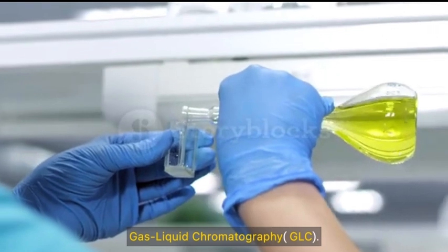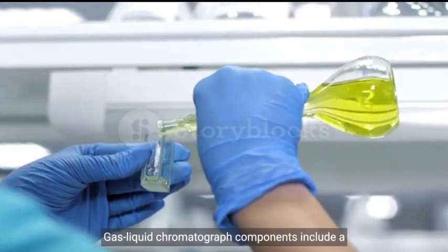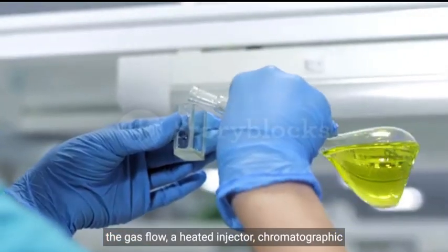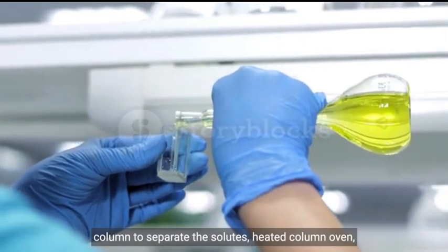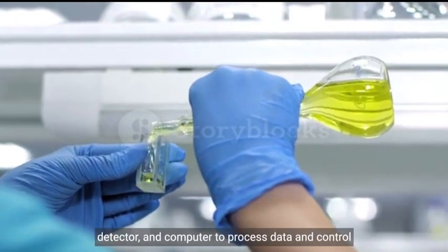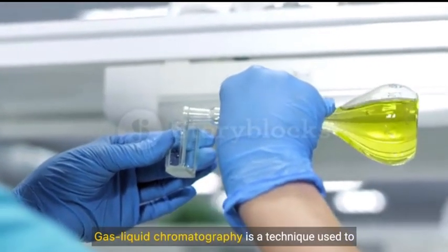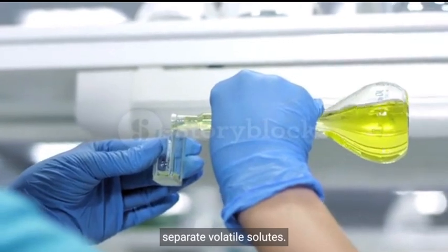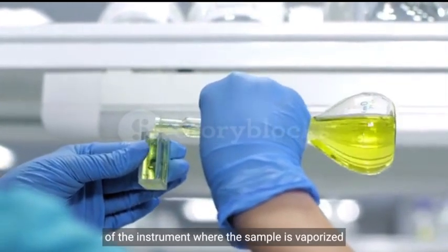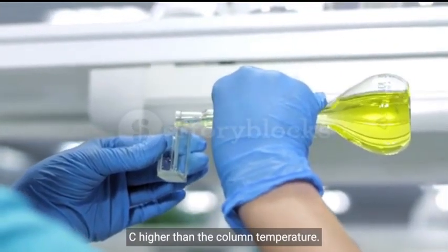Gas-liquid chromatography, GLC. Gas-liquid chromatograph components include a carrier gas with a flow control device to regulate the gas flow, a heated injector, chromatographic column to separate the solutes, heated column oven, detector and computer to process data and control the operation of the system. Gas-liquid chromatography is a technique used to separate volatile solutes. The sample is injected into the injector component of the instrument, where the sample is vaporized because the injector is maintained approximately 50 degrees Celsius higher than the column temperature.